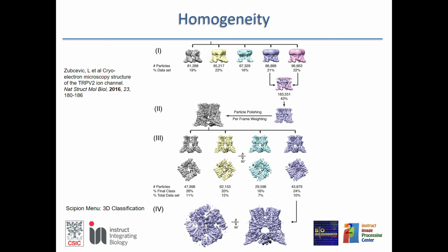For some images it is clear, for some other images it is not so clear. So you should always repeat this 3D classification process a few times, just to make sure that the images you are putting together are always together, so that you can trust the decision of putting them together.